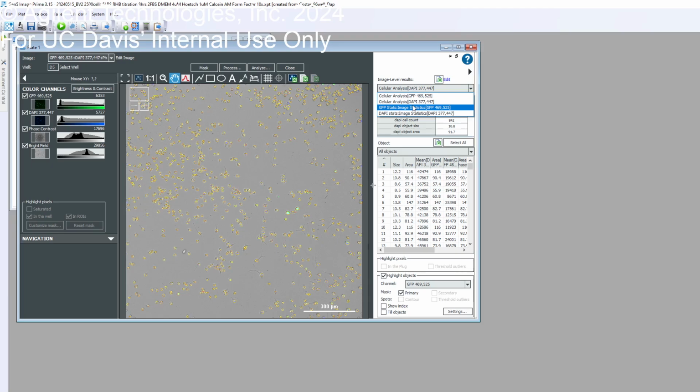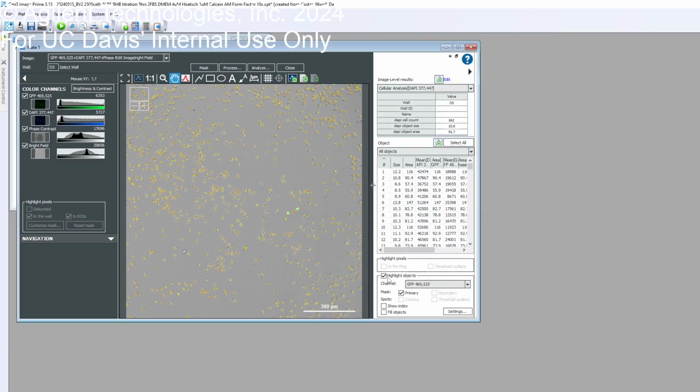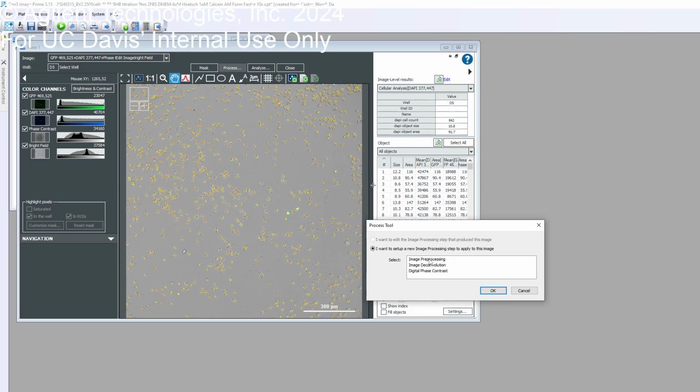For GFP. All right, yeah. So we can go to the calculator step, which is the one next to it, and then delete that from the statistics. Right click and remove. Yep. All right, and then click OK. Do you think the pre-processing might help the results, or do you want to skip it? Yeah, let's do it. Why not? Sure. So, apply that pre-processing.